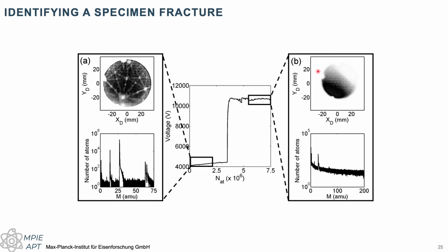And here what I see is a pattern that's completely inhomogeneous. And the mass spectrum is mostly noise and a bit messy. And yes, there's still a peak corresponding to maybe some aluminium that was in that sample. But mostly that data I cannot trust. And this was a sign that effectively there was a fracture during the analysis. We probably lost a whole chunk of the specimen, and that data set should probably only be analyzed up to about that point.